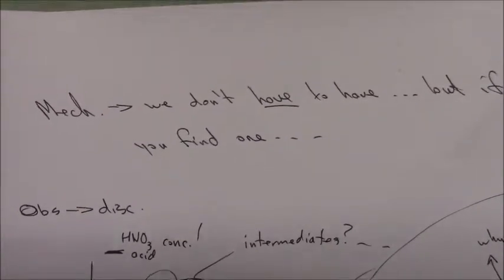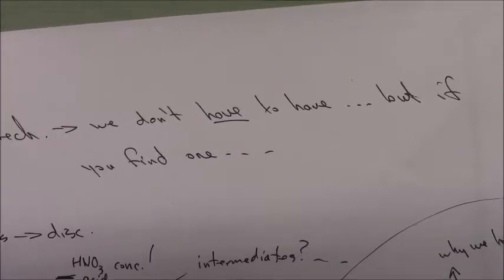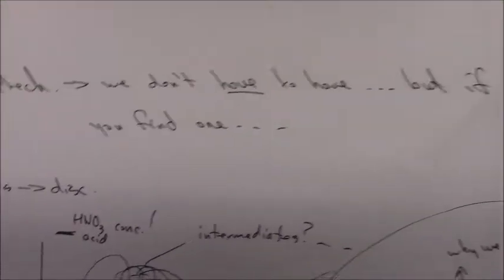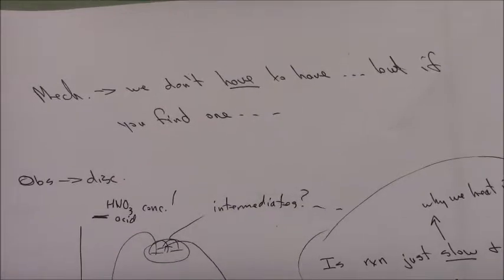Now we move on to discussion. So the mechanism, you don't have to have it, because the nitric acid acting on it, oxidizing, is not a McMurry, it's not a common one that we'd have to know, but if you find one online to suggest, that would be nice.